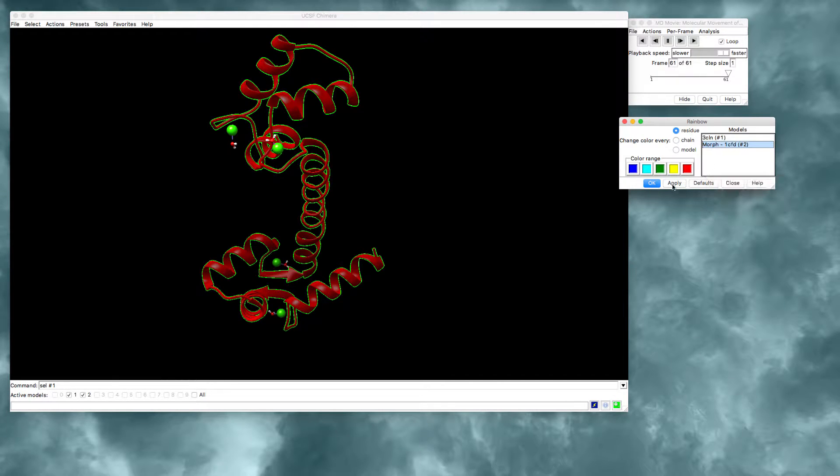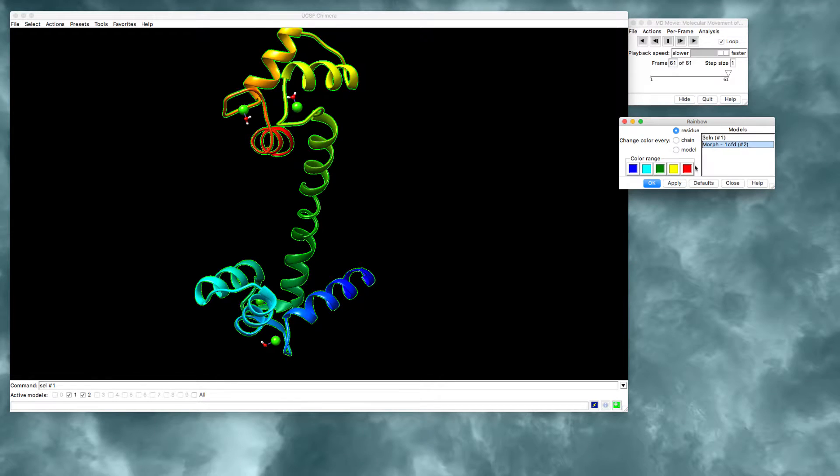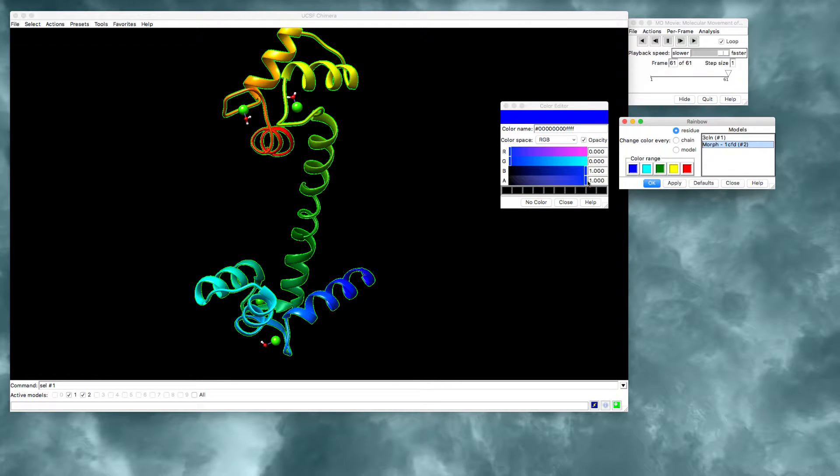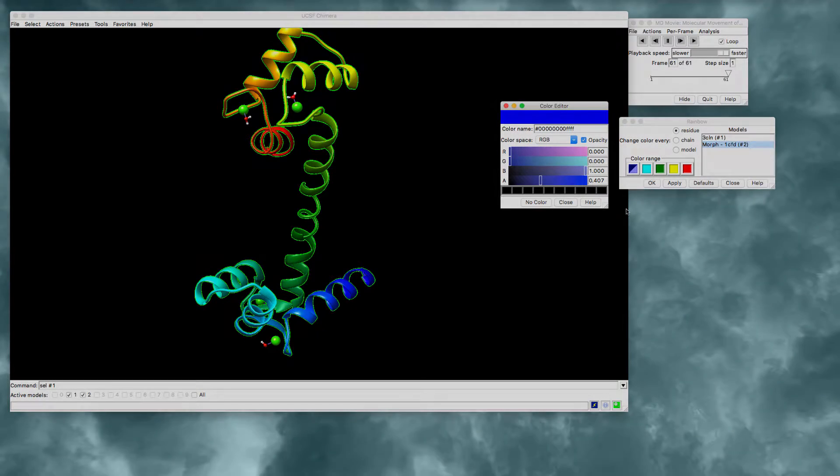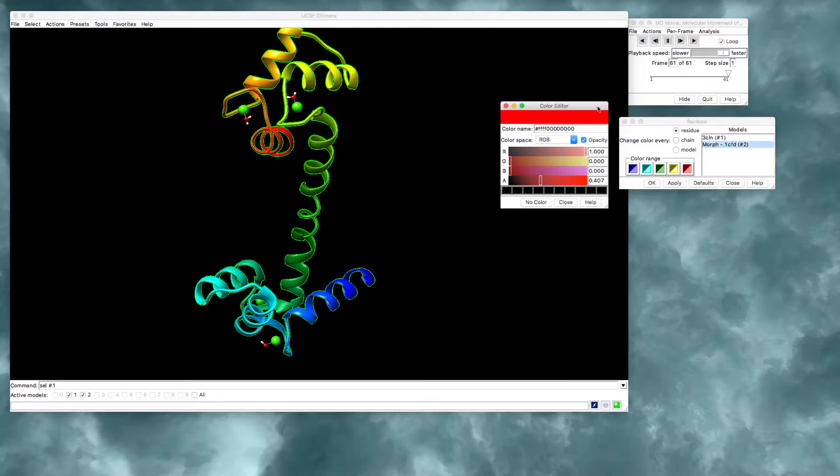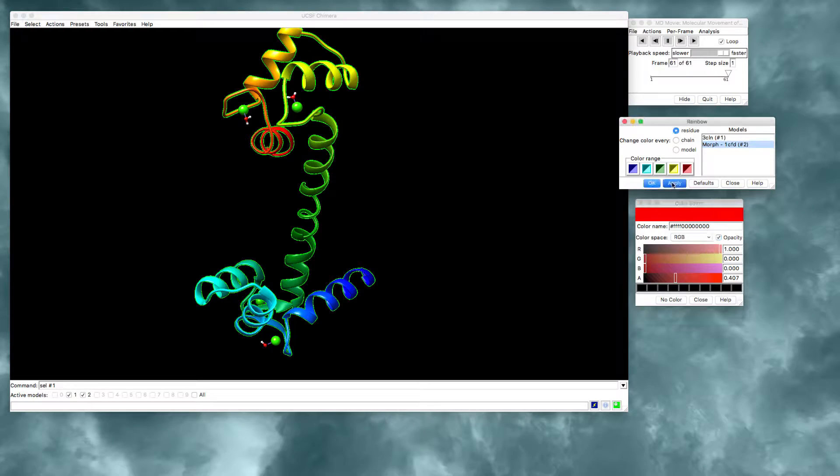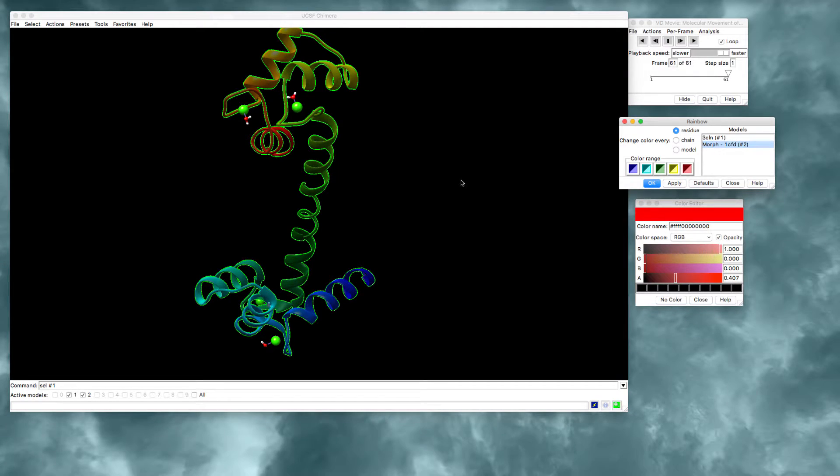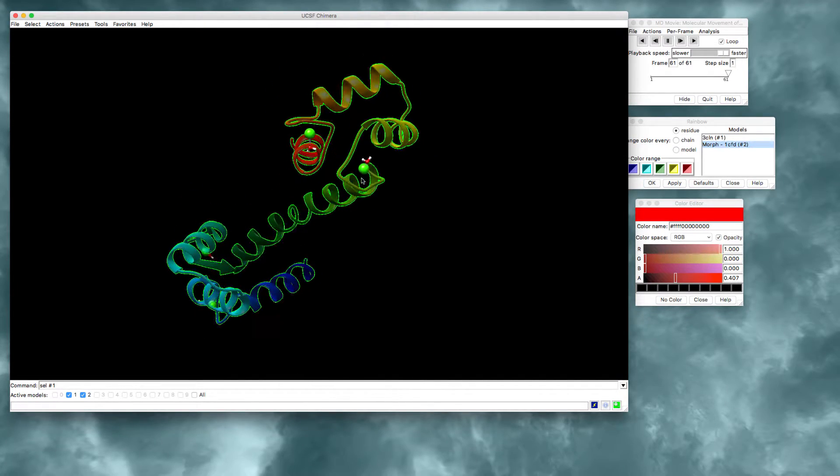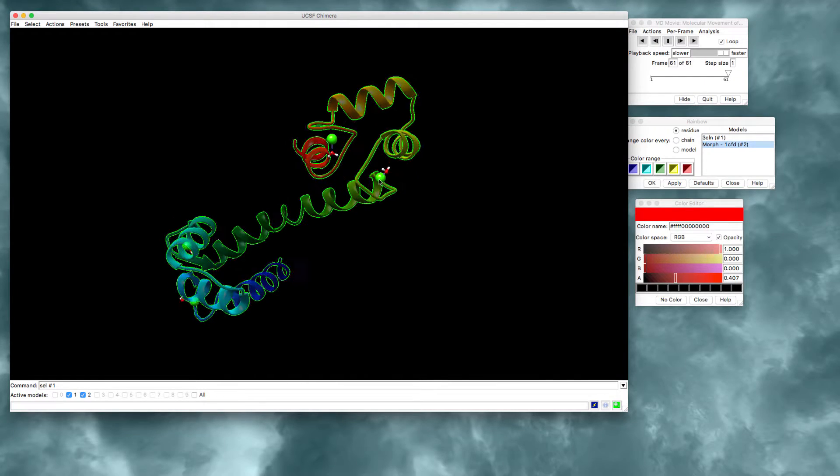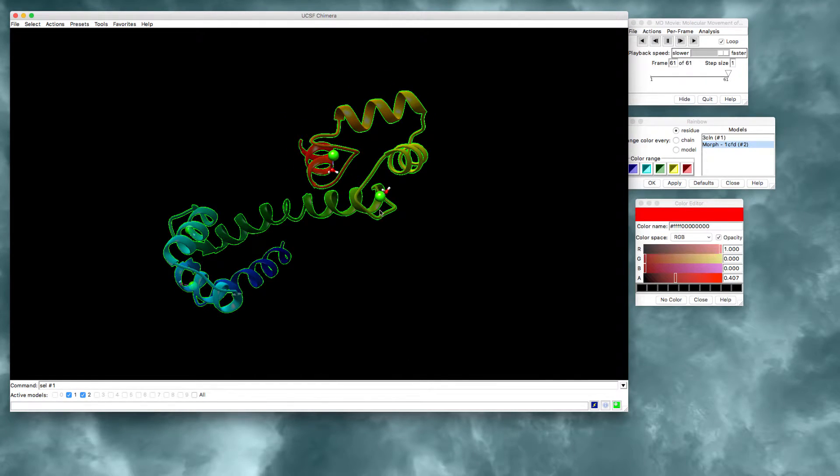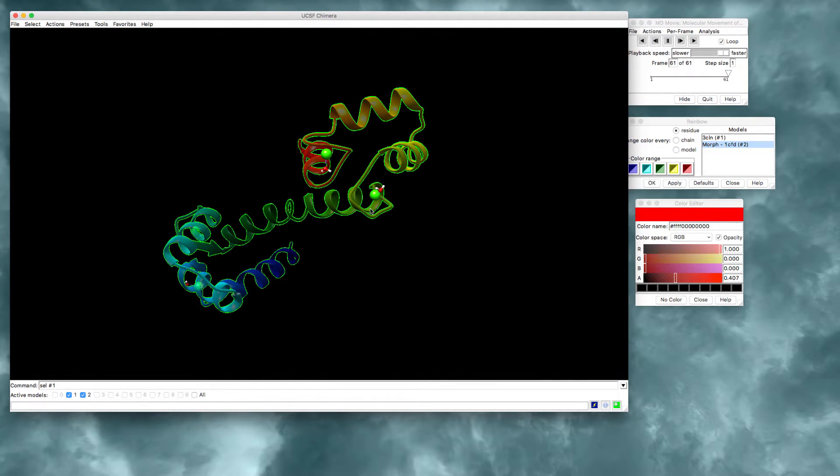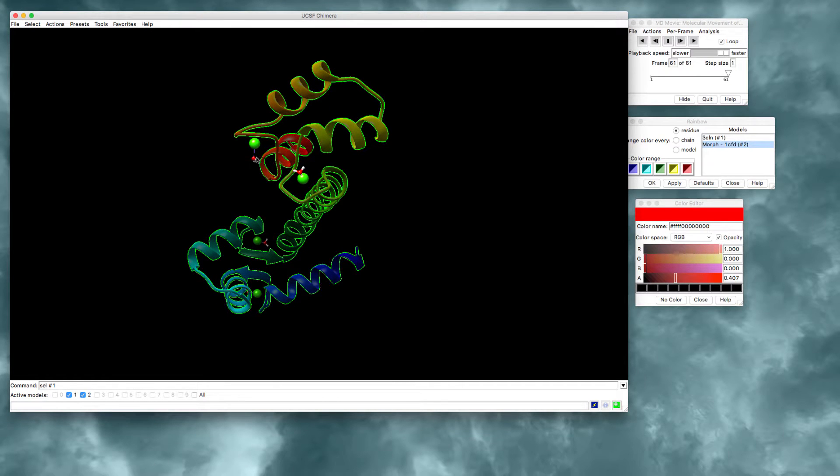You can also make these colors transparent by clicking on each individual color and making sure this box is checked. And then you just use this slider. Let's make it 40%. And now once you make all of the colors semi-transparent, you can press apply and it makes the rainbow semi-transparent. So now the only things on the structure that are opaque are the calcium ions and the water molecules that are bound to those calciums.